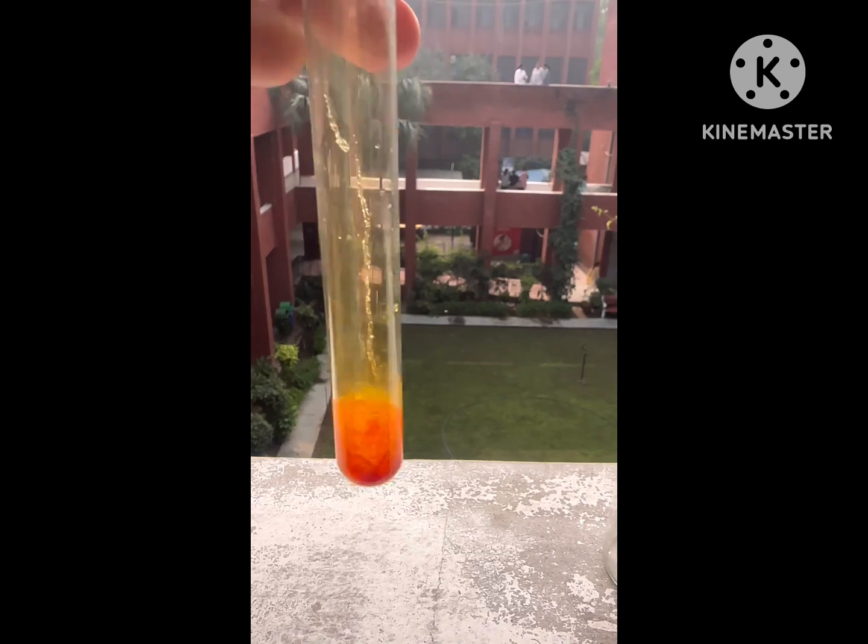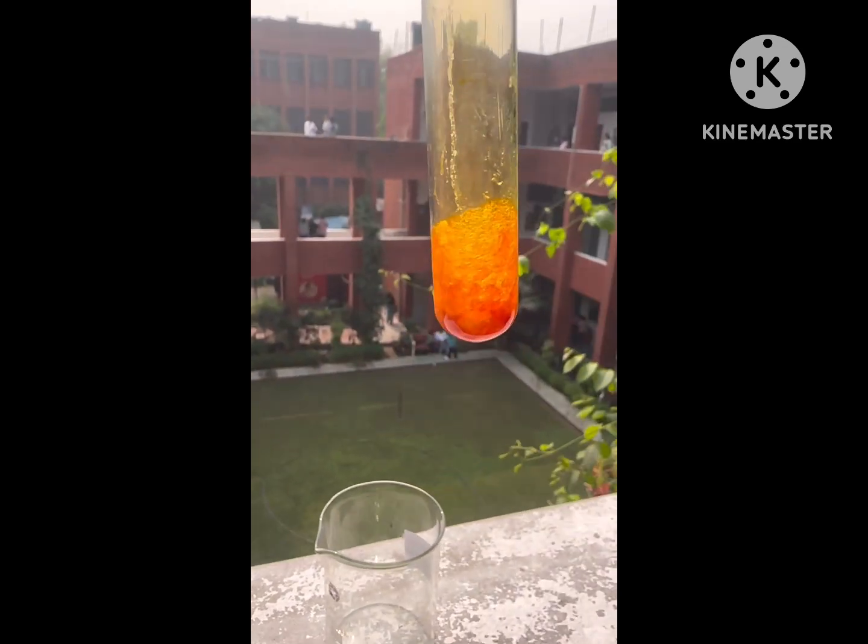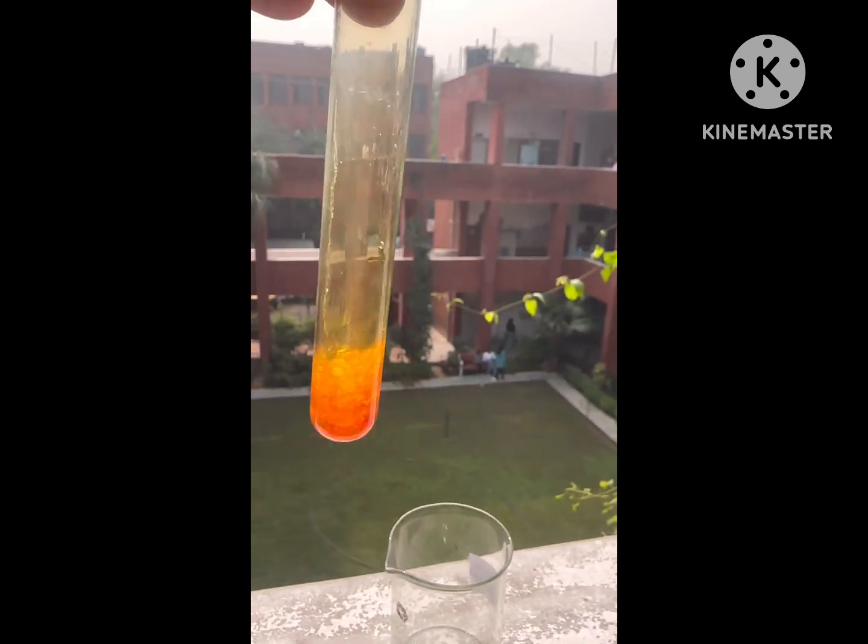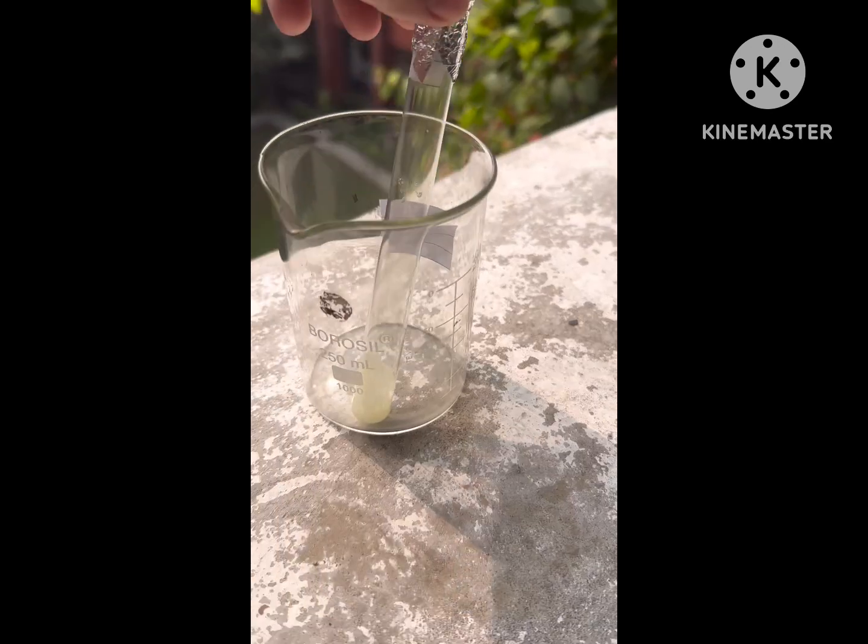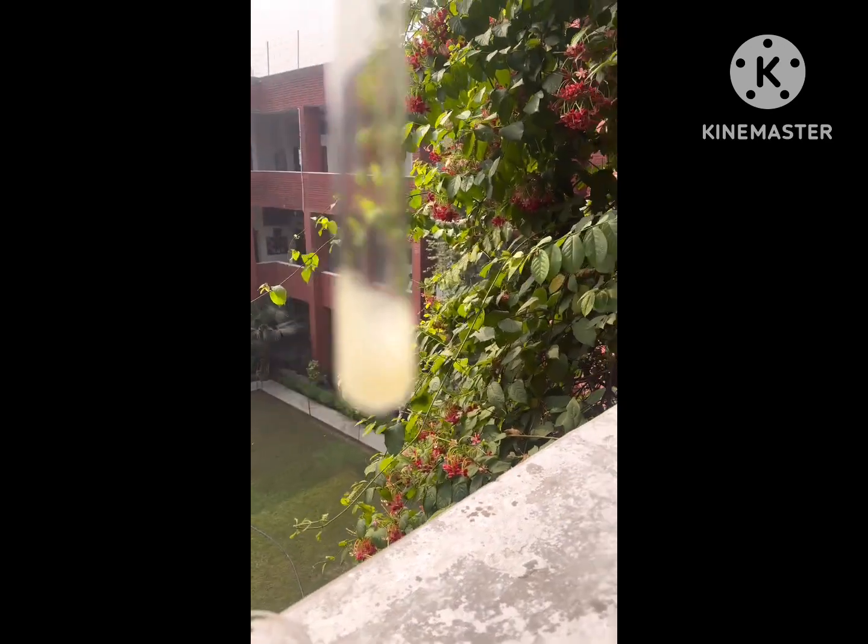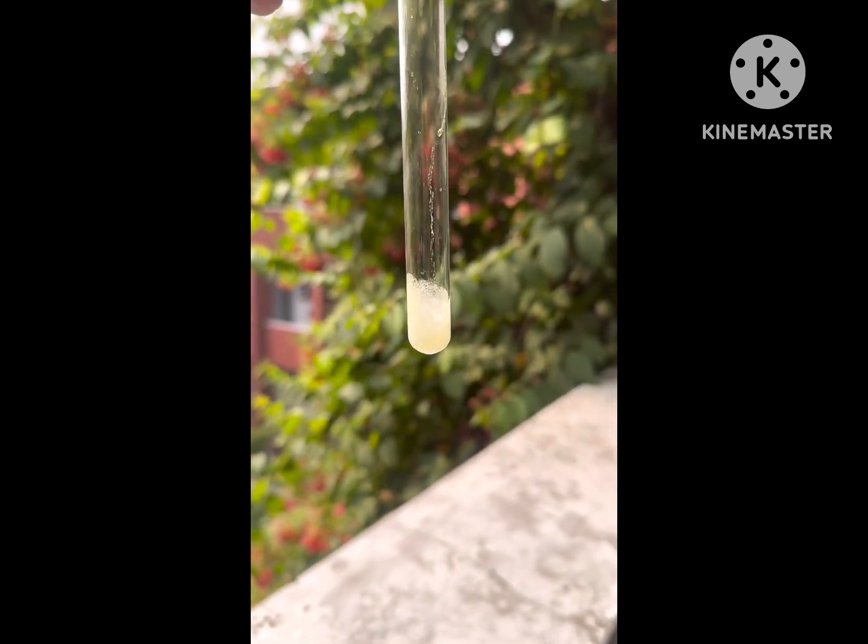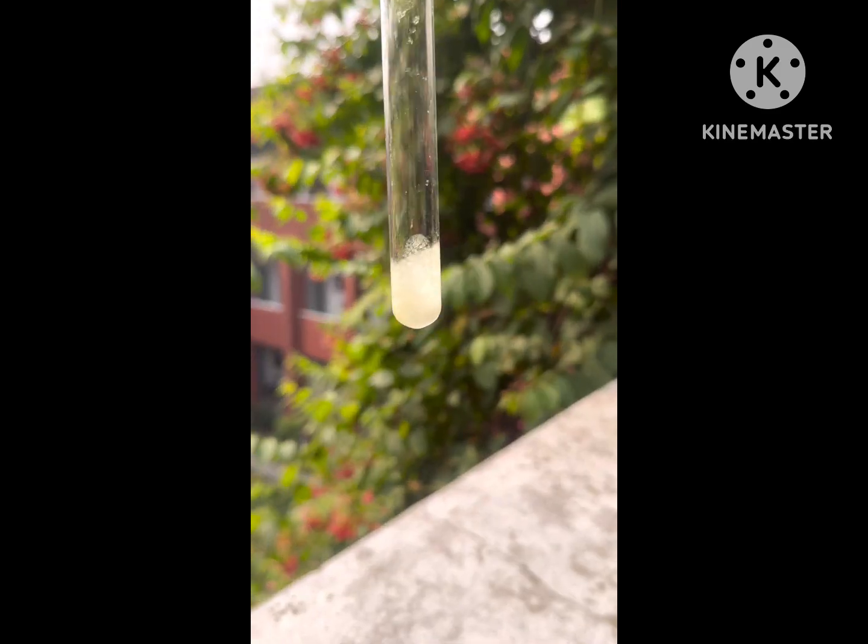Now we will keep this reaction mixture in sunlight for next 10 minutes so that the reaction gets completed and whole of the dimethyl maleate gets converted into dimethyl fumarate. So now we get the white solid.